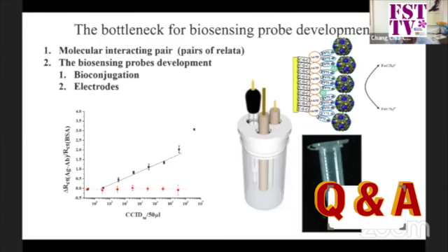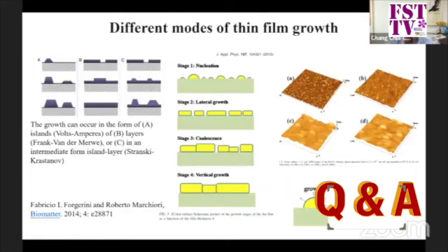Another issue is with this kind of metal sputtering. As I mentioned, with the regular sputtering method, the metal ions and metal granules are sputtered on the surface and may form the active structure. However, if you leave it for a long while, due to thermal migration their conformation may change, so their surface activity may reduce.